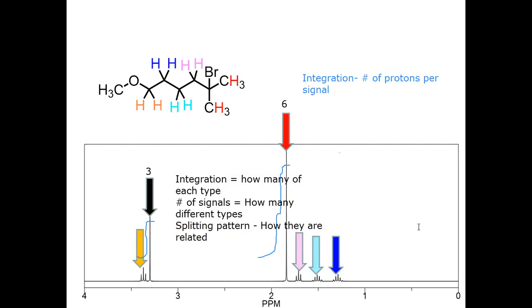That's a great question. But yes, the helium shortage, we've been hit by that because we have to fill our magnet once a year, and it costs about 5,000 every time they come out. And the price keeps going up because the amount of helium just keeps decreasing. For whatever reason, there's been a shortage for the last several years. Now they make NMR magnets that are called cryo-cool magnets.